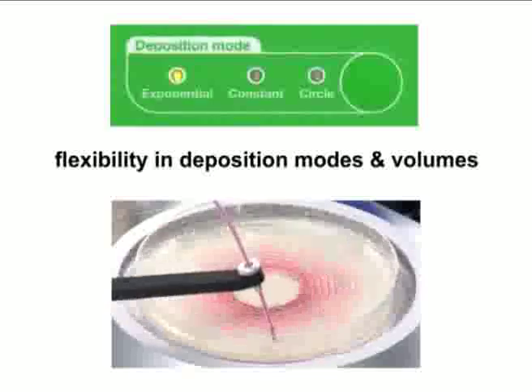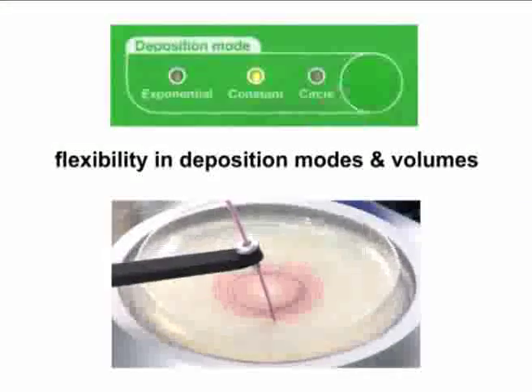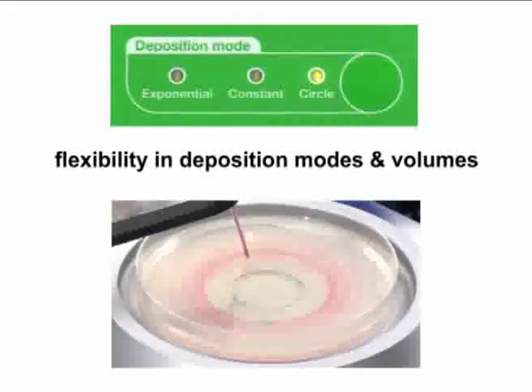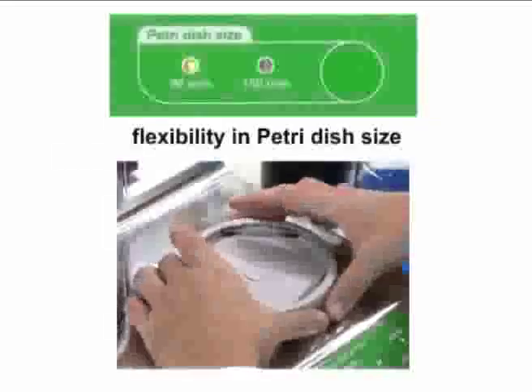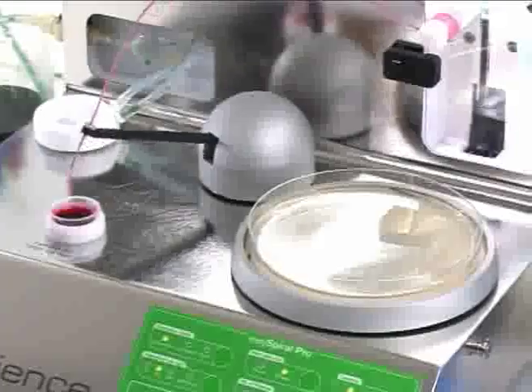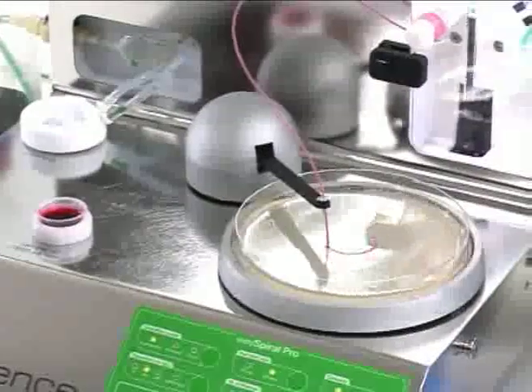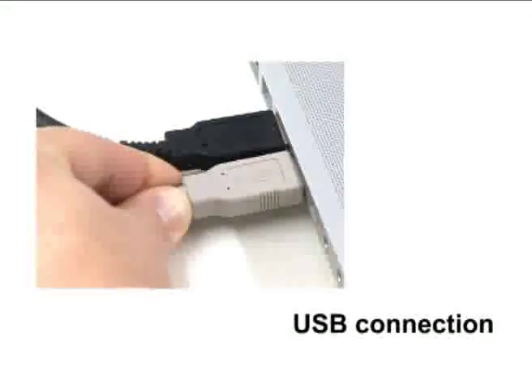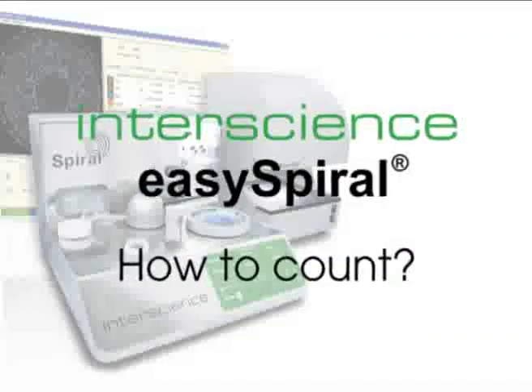Press just one button and choose from three different plating modes and two petri dish sizes. You can also customize your plating with a computer using a standard USB connection. The EZ Spiral software allows you to fully customize your sample plating and save sample data on your computer.